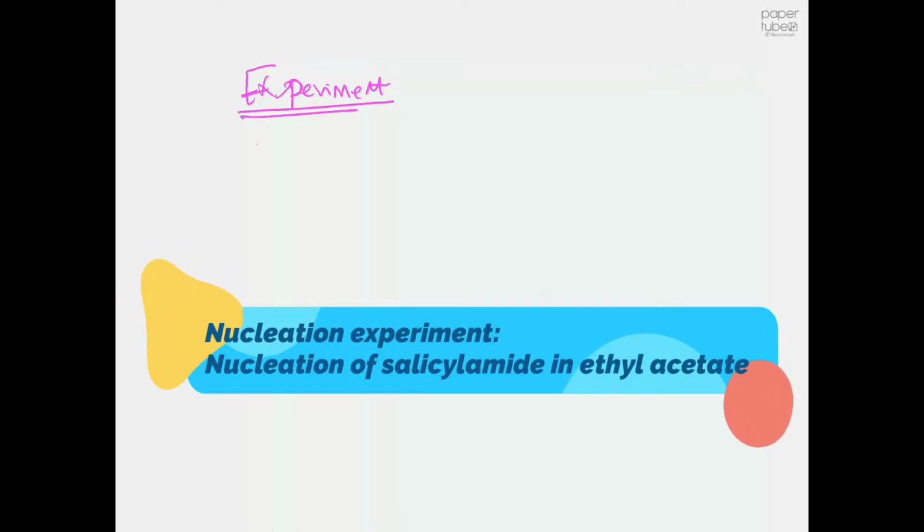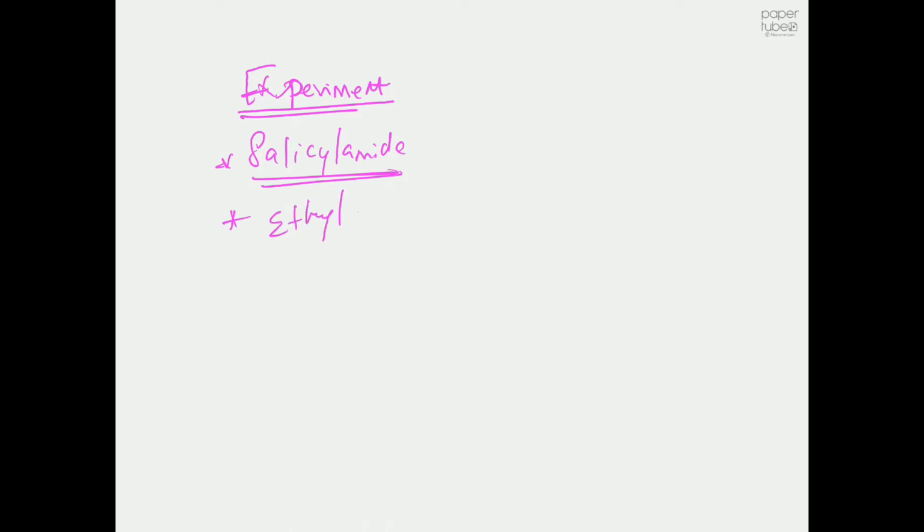We'll quickly say how we did this particular experiment in the lab. The system that we are focusing on is not salicylic acid, it's salicylamide. I think before I said salicylic acid, it is salicylamide. Then we are going to crystallize in the presence of ethyl acetate.